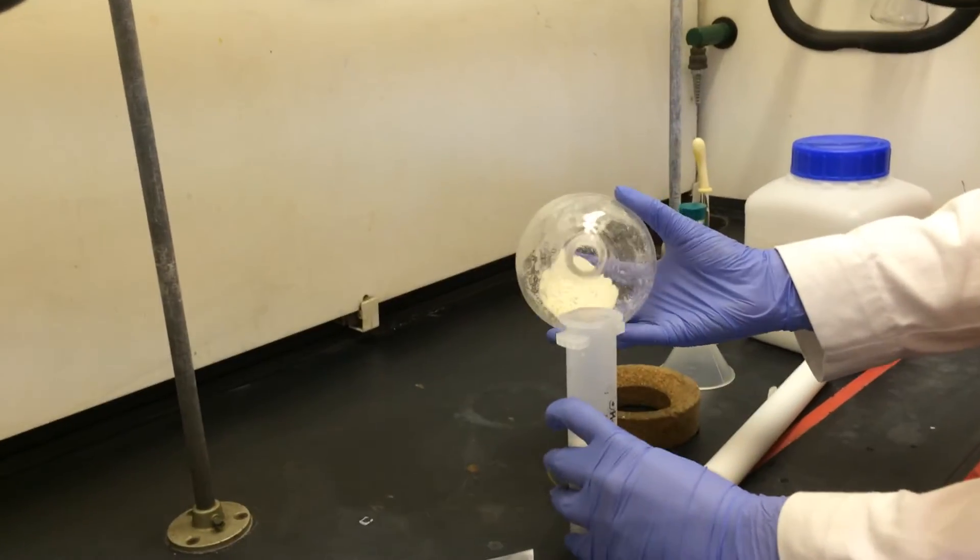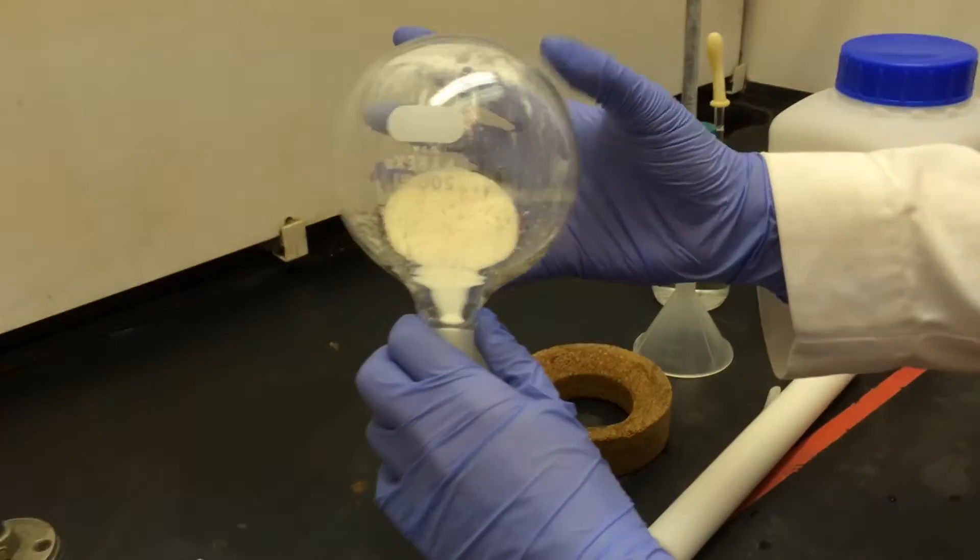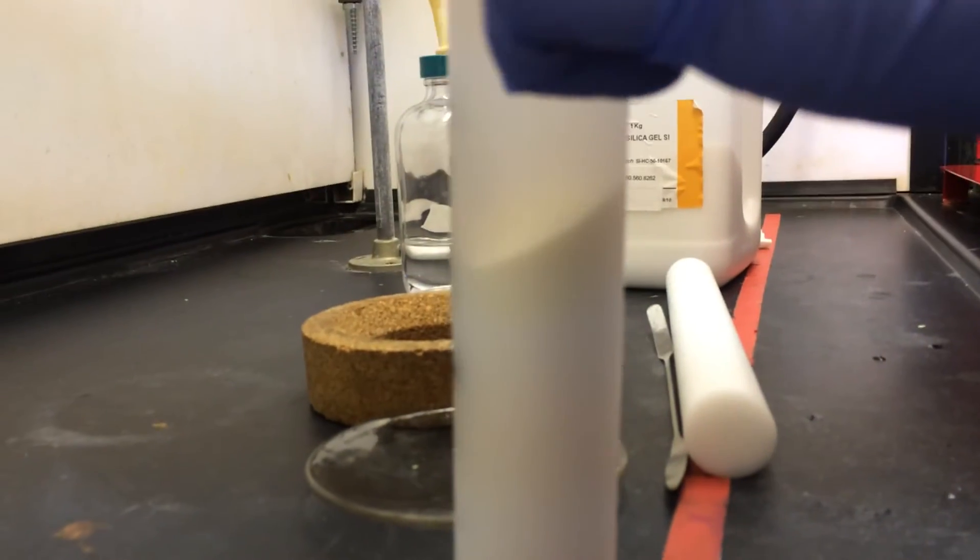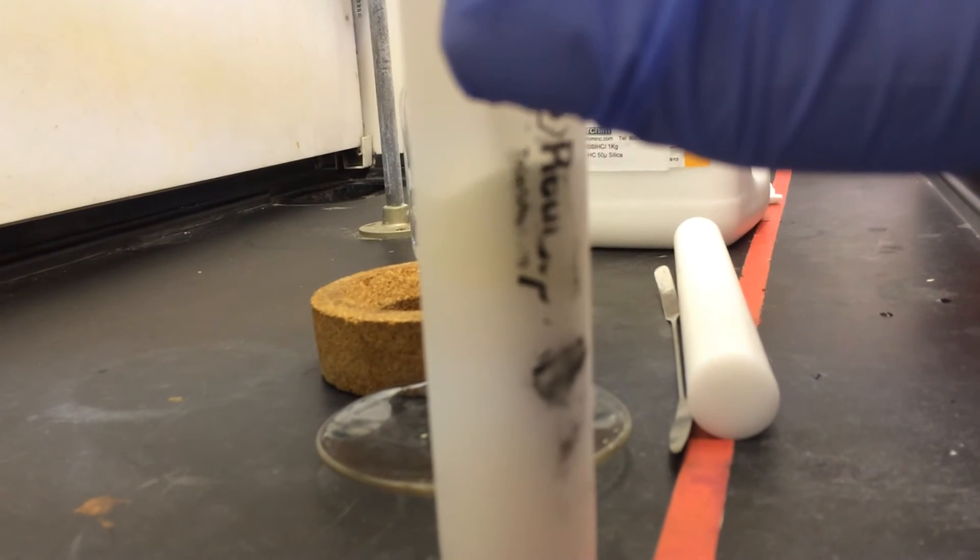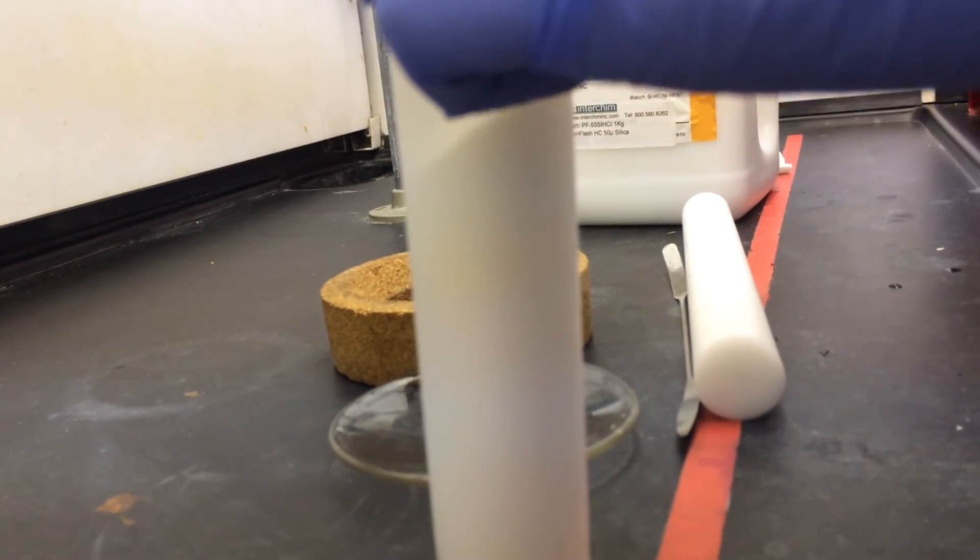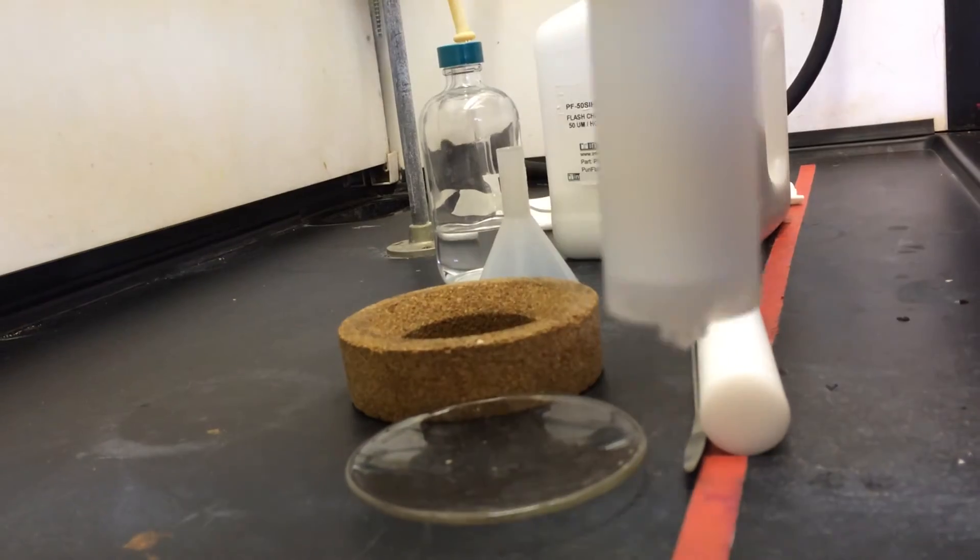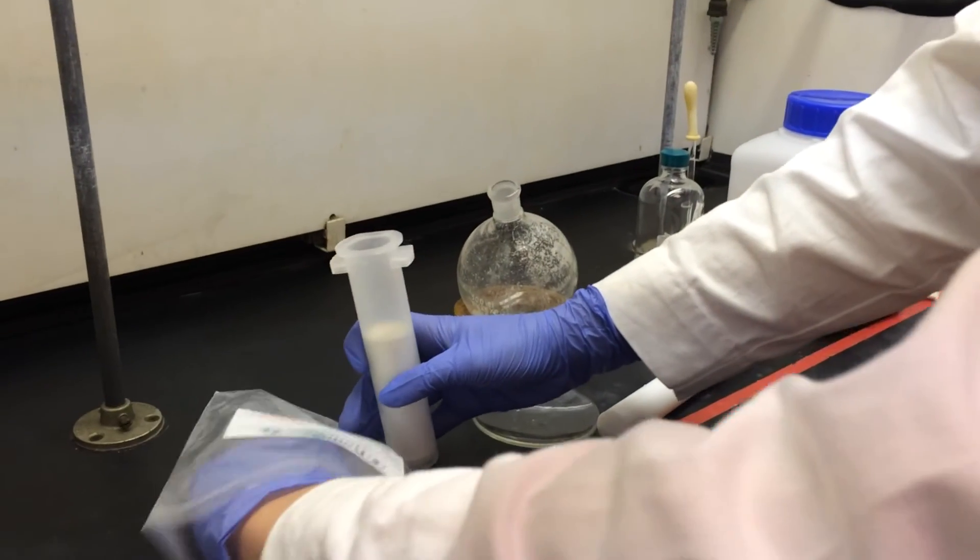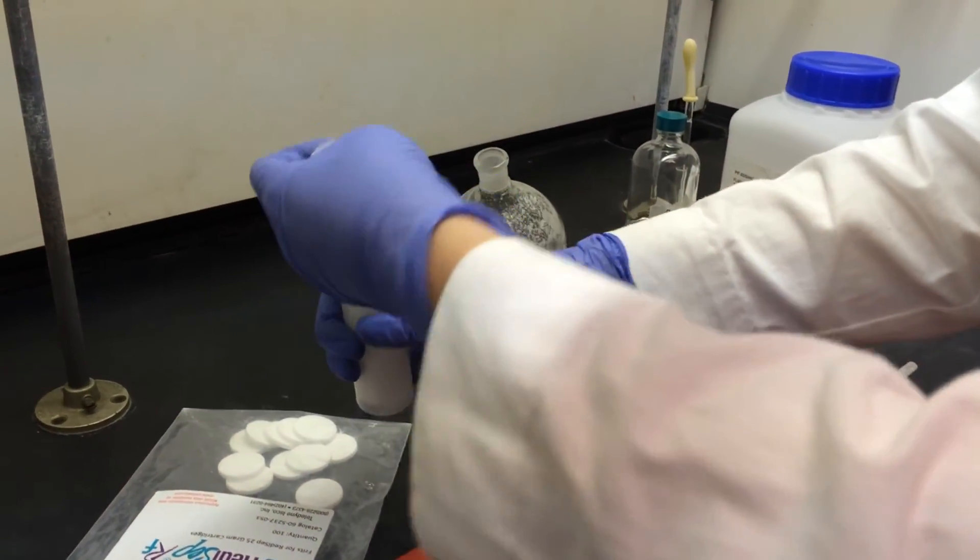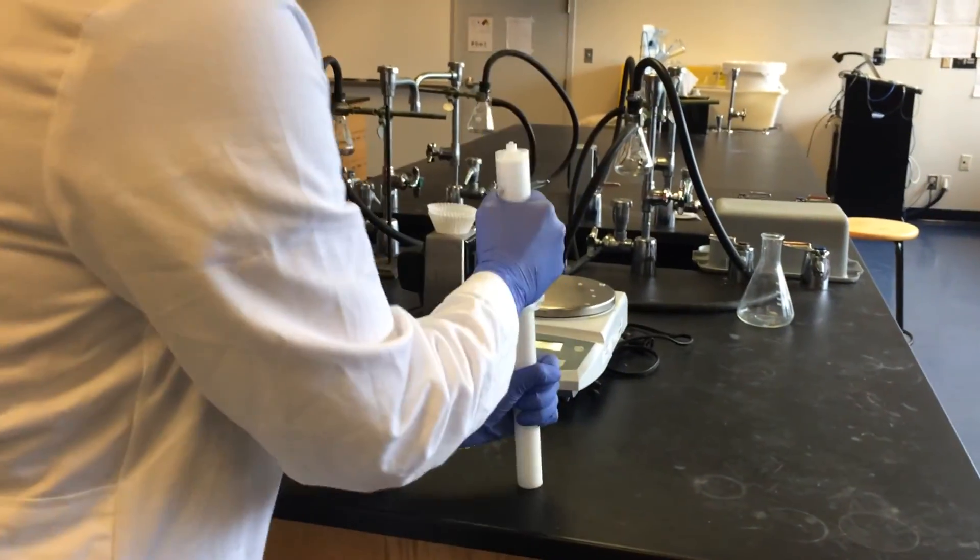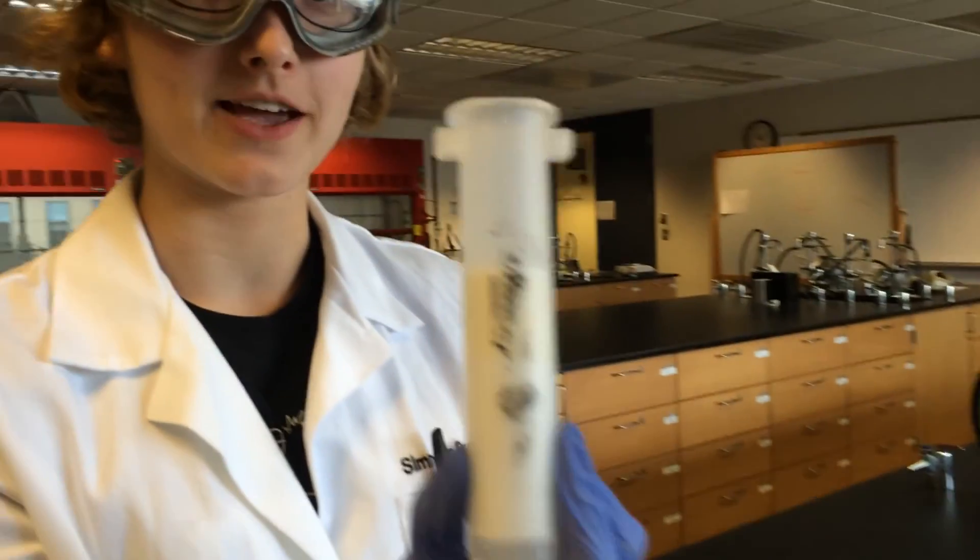Then you slowly add your sample. When your sample is all set, you're going to take another frit, place it in the top and use the PVC pipe. Bang it on the countertop again. And now your cartridge is all set for the combi.